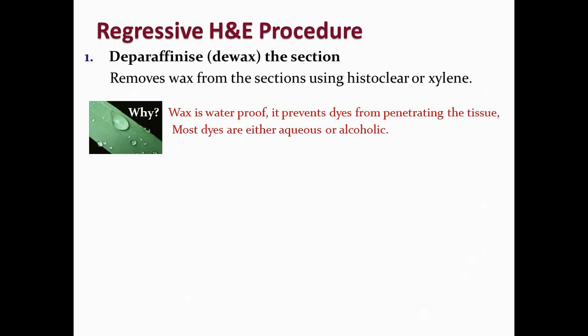So when we cut our sections on the microtome, they were in wax. So before we can actually stain the slides or the sections with water-based dyes, we have to remove the wax, because if you go back to embedding, you'll remember that water and wax don't mix. So we have to first remove the wax using HistoClear.